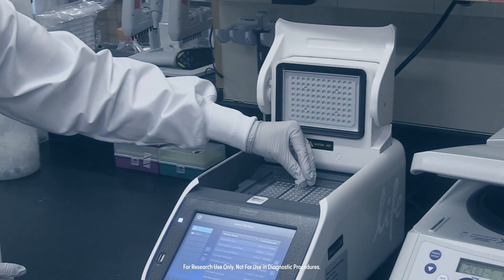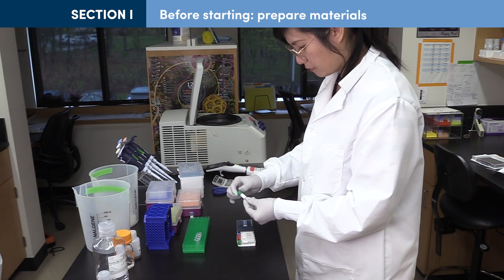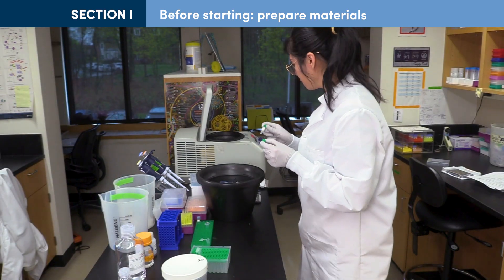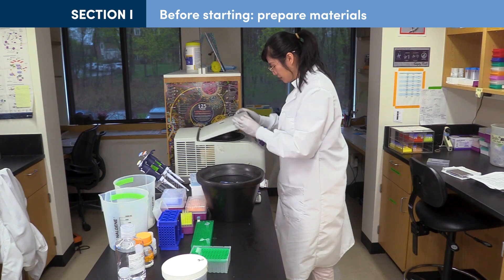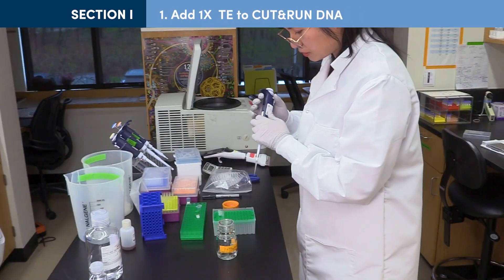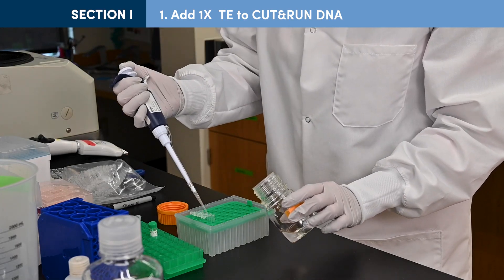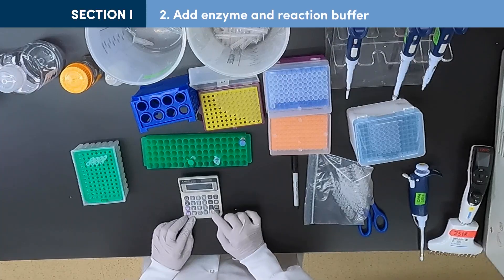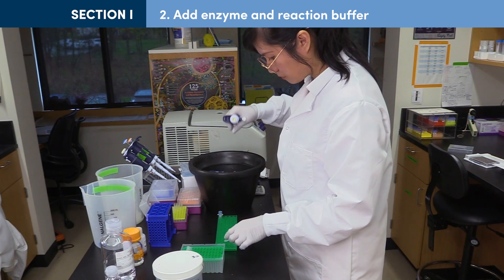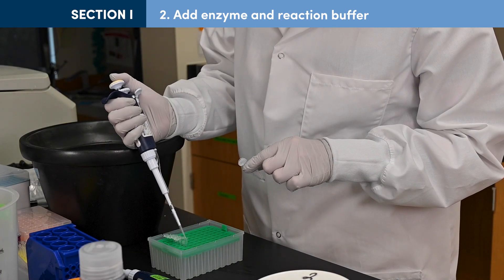Let's begin the protocol. Before starting end prep, thaw end prep reaction buffer at room temperature, vortexing if a precipitate is visible, and perform a quick spin of the end prep buffer and enzyme to collect material at the bottom of the tube. Prepare 1X TE buffer as indicated in the protocol. For each Cut and Run sample and input control DNA, add enough 1X TE to bring the volume to 50 microliters. Make a premix of 3 microliters end prep enzyme mix per sample and 7 microliters end prep reaction buffer per sample, then add 10 microliters of premix to each sample in PCR tubes.